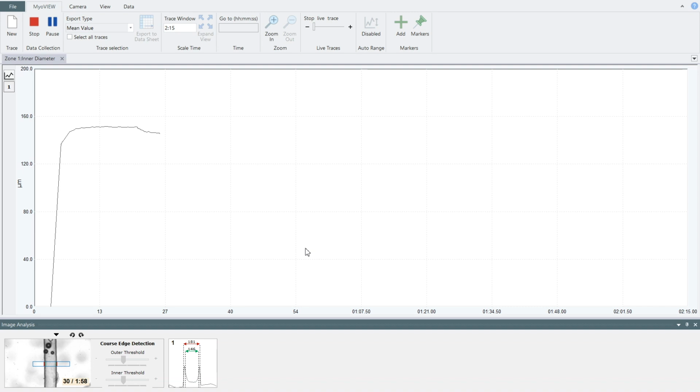In order to get the best wall tracking, you will need a good contrast between your vessel and the background. Also, removing all extraneous tissue will help the wall tracking. As the experiment progresses, you will see the walls are automatically tracked through pressure changes or agonist responses.